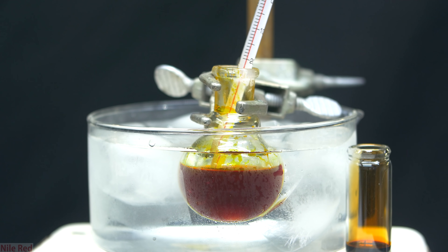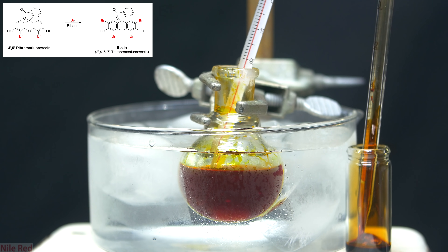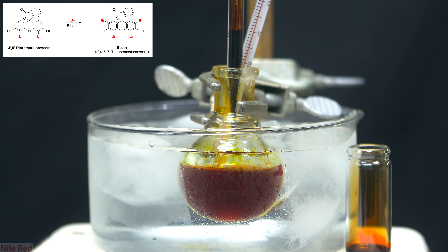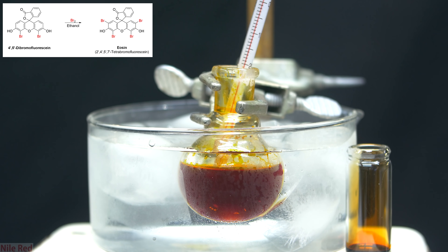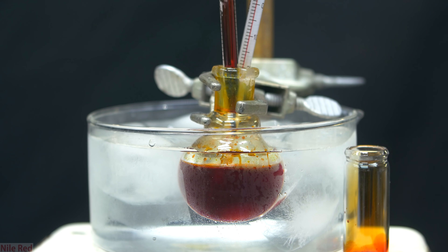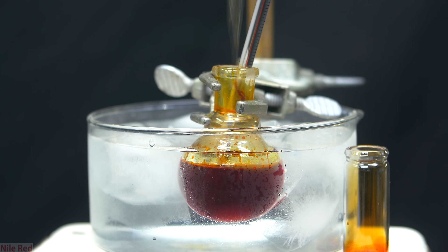I then moved on to adding the second half of the bromine, and this is where we're actually going to be forming our eosin, also known as tetrabromofluorescein. I also want to point out that although I'm using an ice bath here, it probably isn't super necessary, and we only really need to keep the reaction below about 40°C. The addition of bromine is slightly exothermic, and as I continue to add the rest of the bromine, it seems like the solution clears up a little bit.